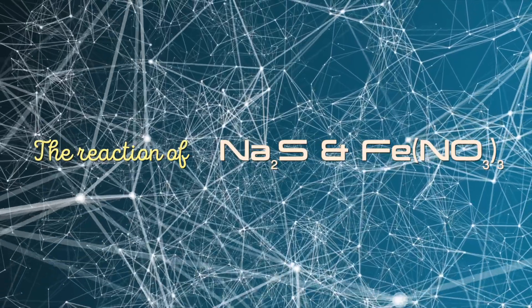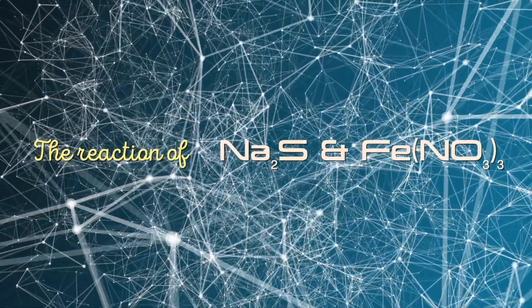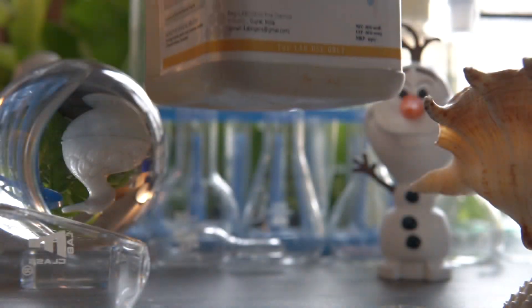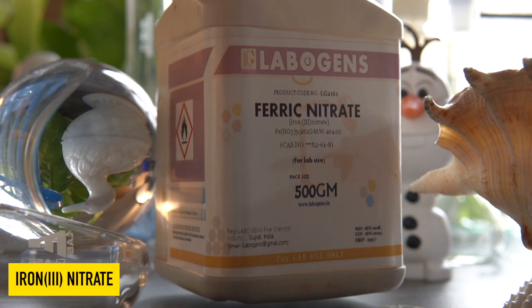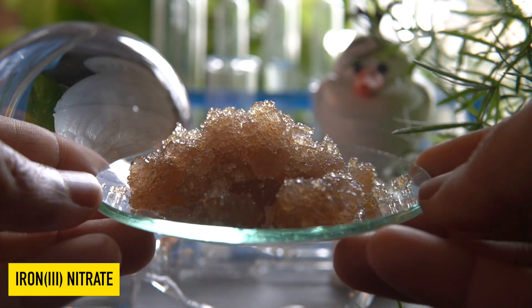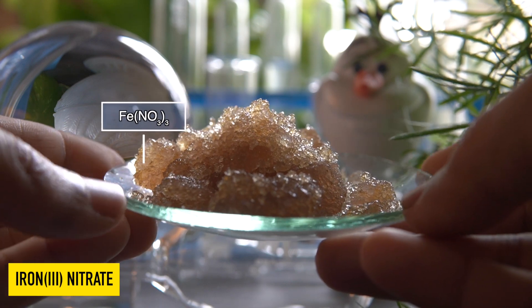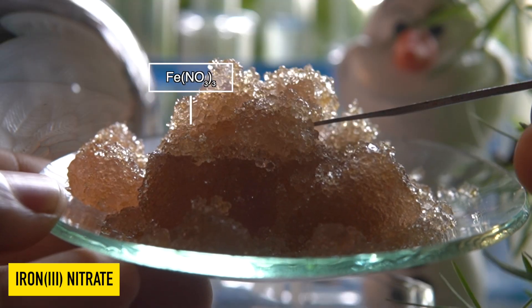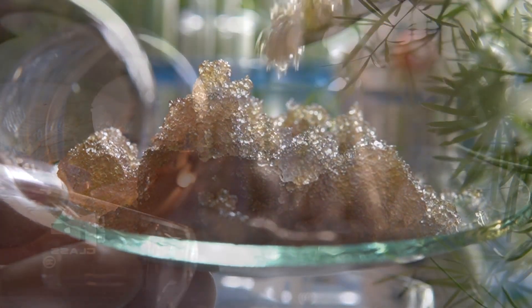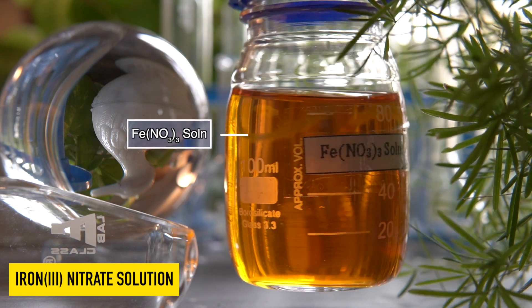Today we are going to observe the chemical reaction between sodium sulfide and iron 3 nitrate. This brown solid is nothing but iron 3 nitrate. This is a hygroscopic substance, meaning it can absorb moisture from air and easily dissolve in it. It is highly soluble in water.